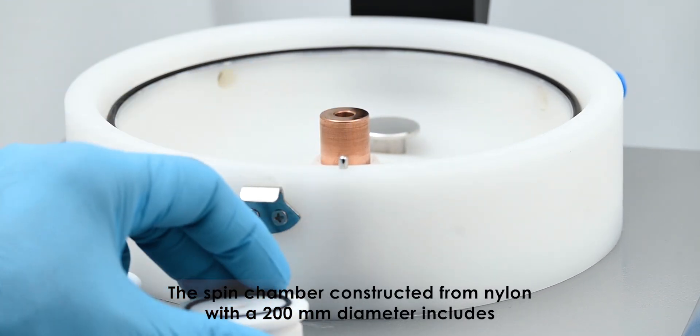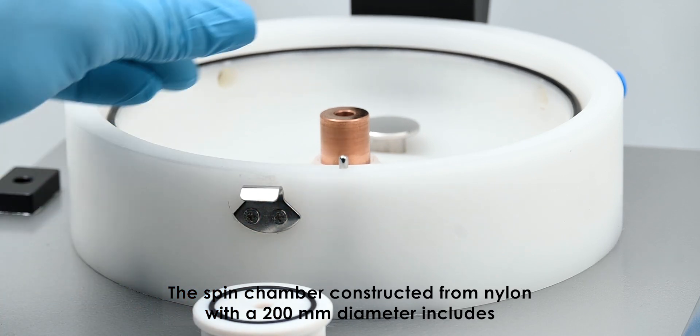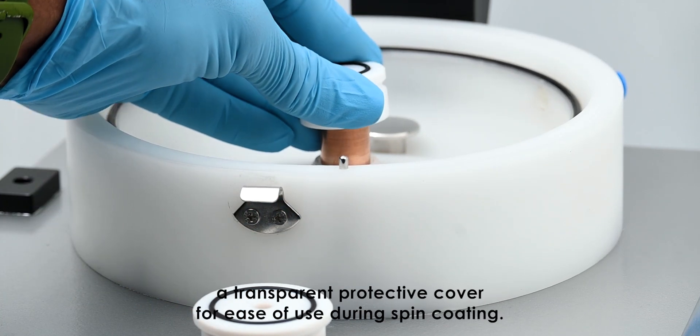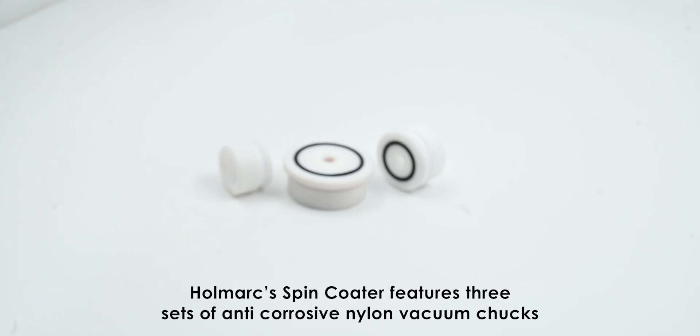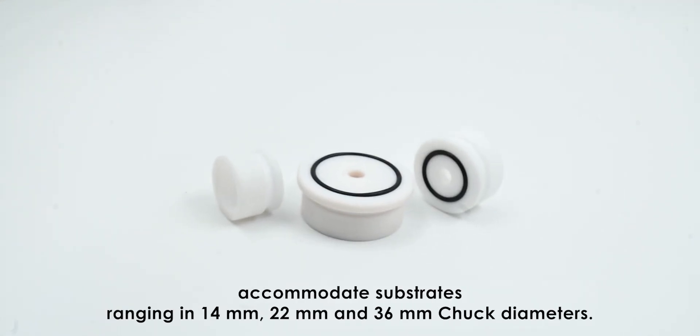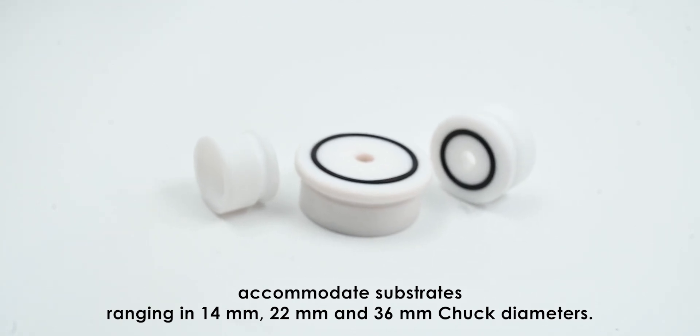The spin chamber, constructed from nylon with a 200 millimeter diameter, includes a transparent protective cover for ease of use during spin coating. Hallmark spin coater features three sets of anti-corrosive nylon vacuum chucks to accommodate substrates ranging in 14 millimeters, 22 millimeters, and 36 millimeters.